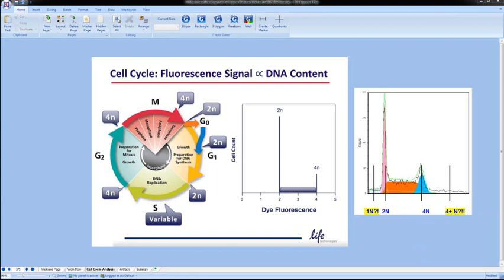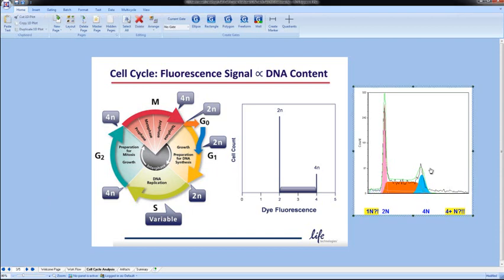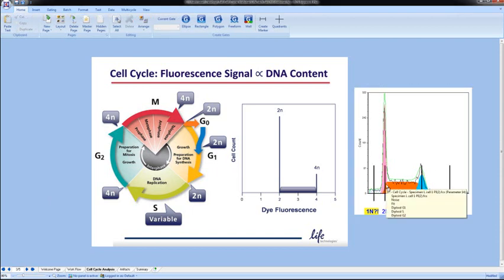And the way that we've typically handled modeling data with flow cytometry data, and now image cytometry data, in the past, is to bring that data into a piece of software and to use something called gates to remove cells from the analysis that we may not want to include in there. Now, if you look at this model on the right, you notice that I have the 2N and the 4N population labeled here with a straight line.